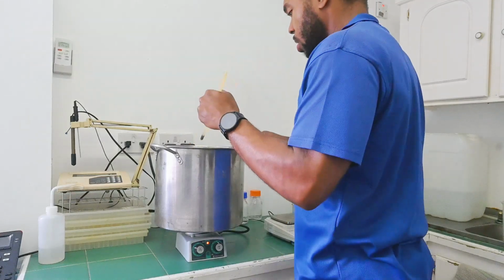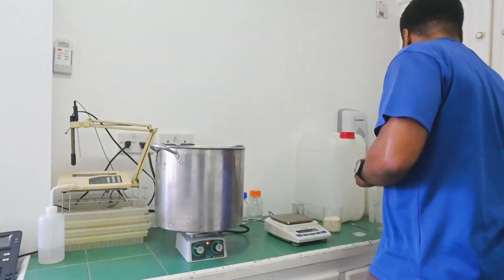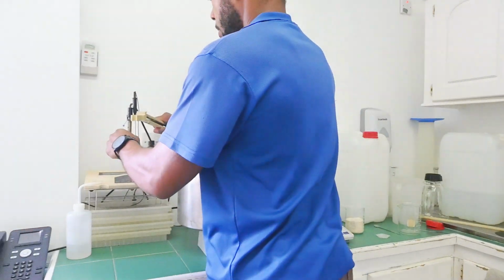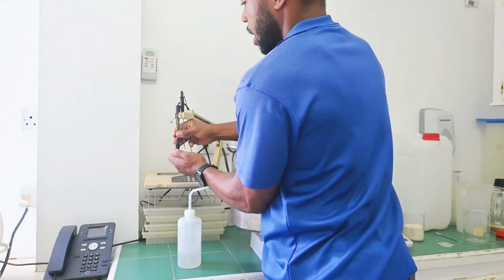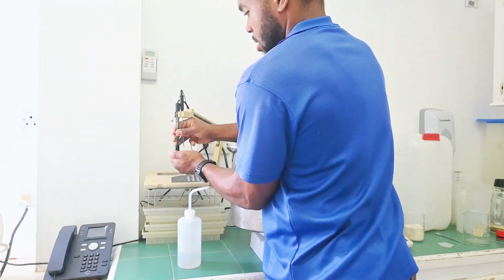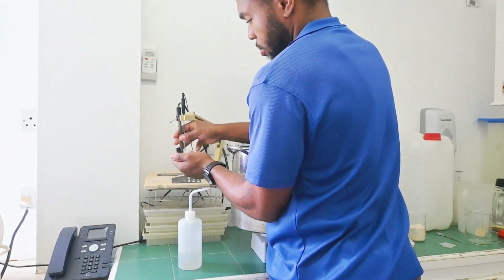So now all the sugar and the myo-inositol is dissolved. We're now going to set up the pH meter. First, you remove the storage cap. In it has filling solution, because in the bottom of the electrode is a probe.